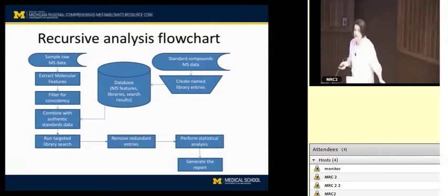We do not. We do have a library of known unknown contaminants that show up in blanks on a regular basis, but we don't do it on a per sample basis or on a per analysis basis. So different samples go through different sample prep. Do you always have a blank for those sets of samples, or do you have some known masses that you think are always in the blank? Yeah, essentially we just have some known ones.